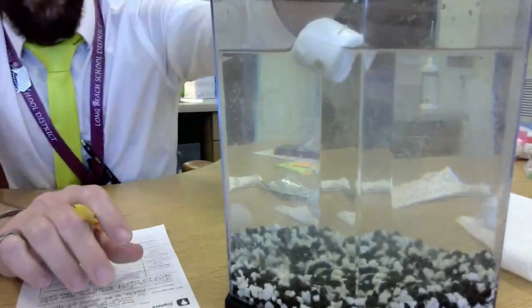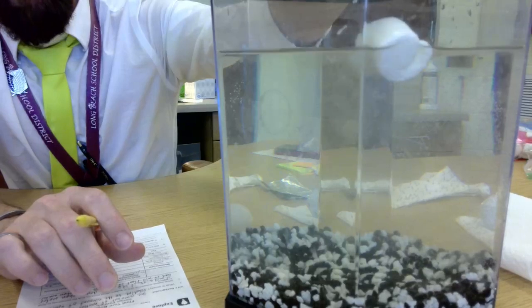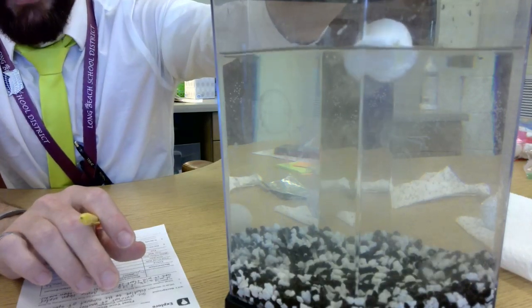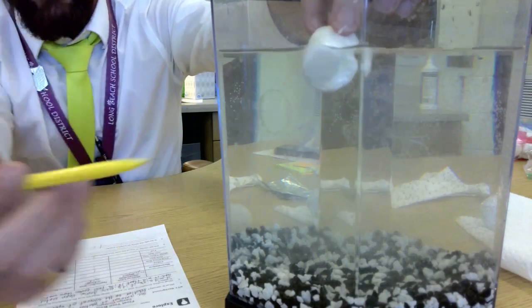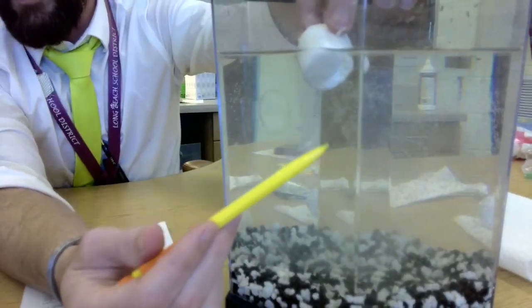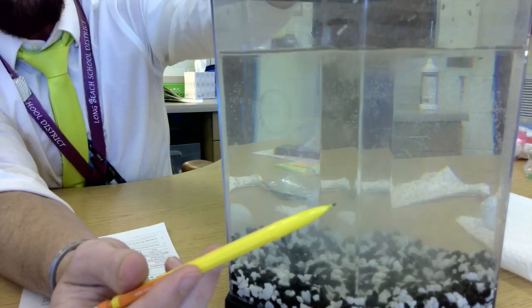All right, y'all remember when you tested the substances, when we looked at those to see if they were soluble in water, right? Soluble in water means it will dissolve in water. So do you think this marshmallow is soluble in water? Well, we're watching it dissolve right here. You can see all that haziness coming off of it. So yes, this marshmallow is soluble in water. It can dissolve in water.